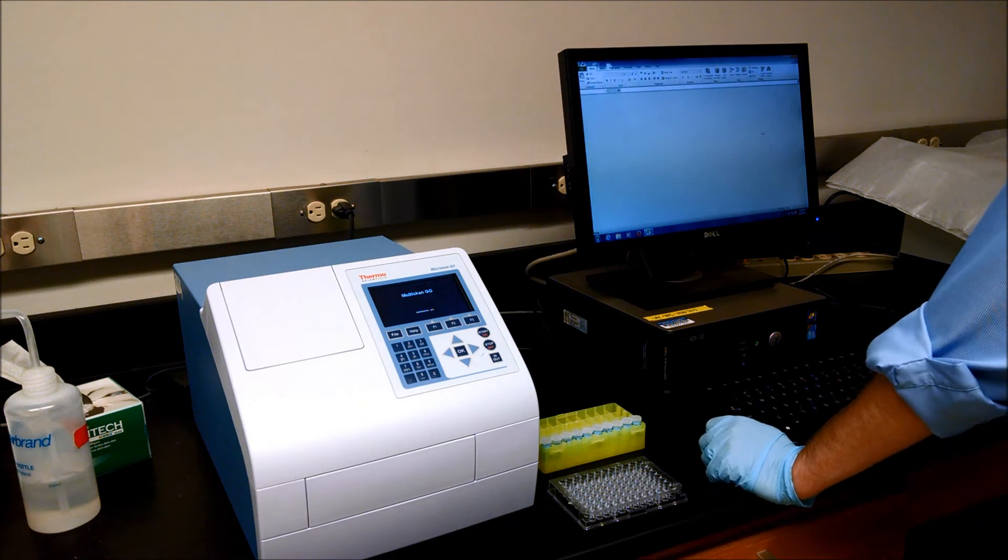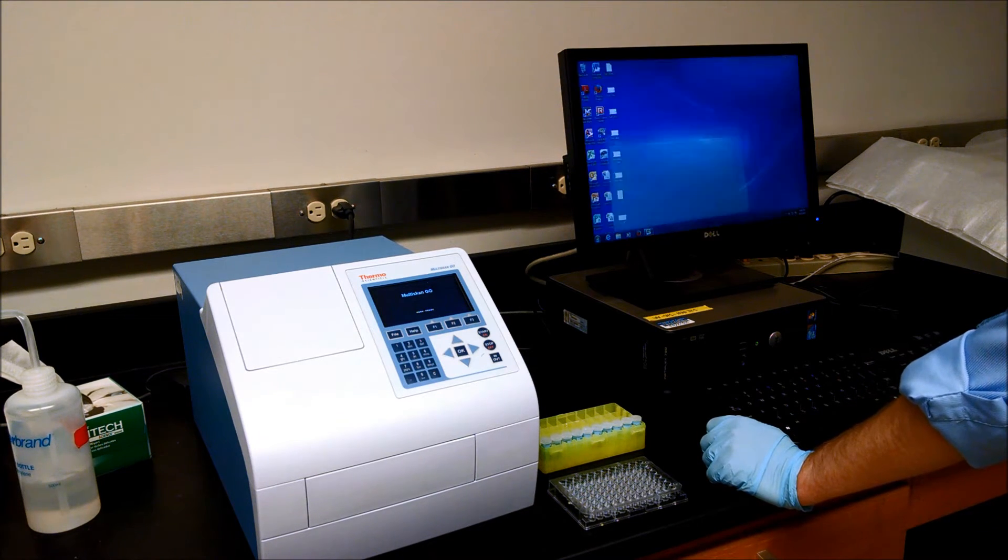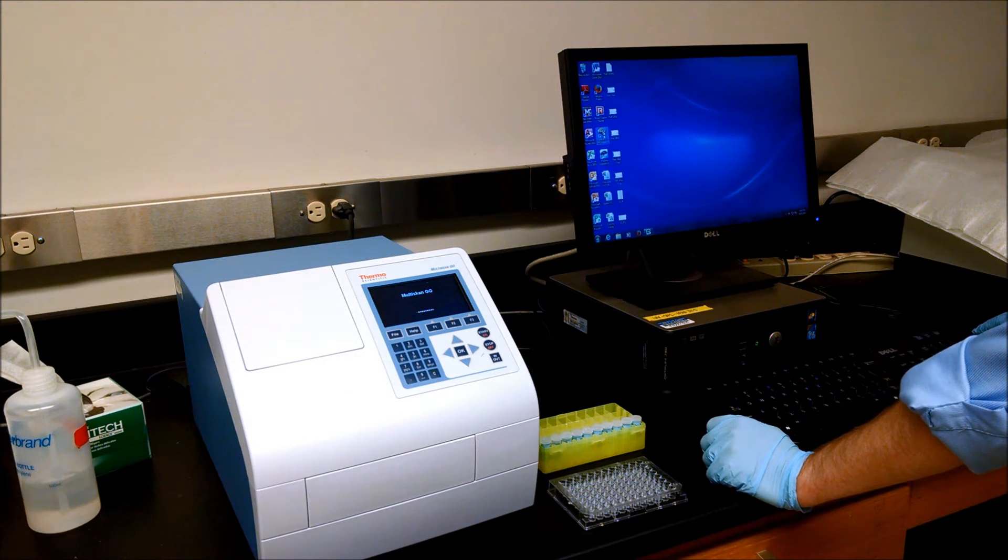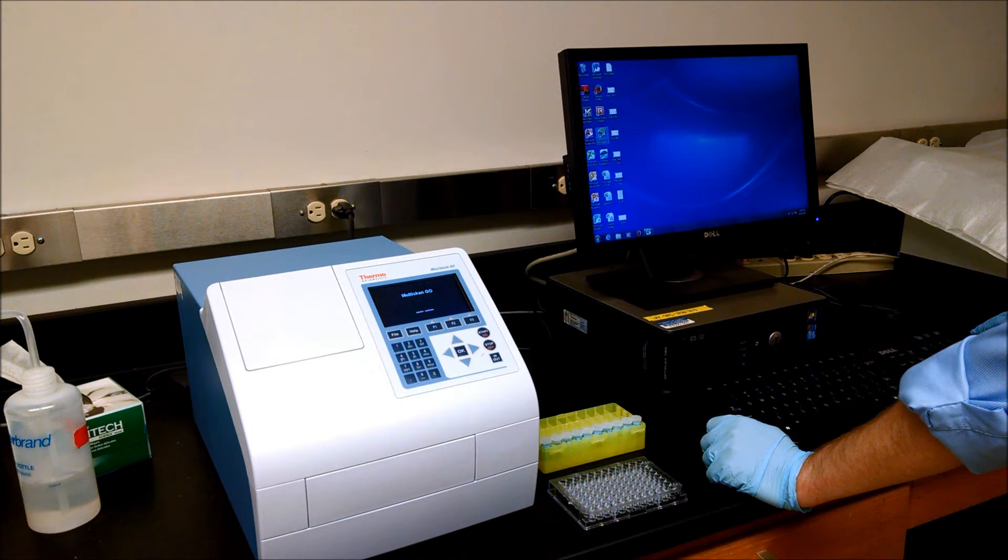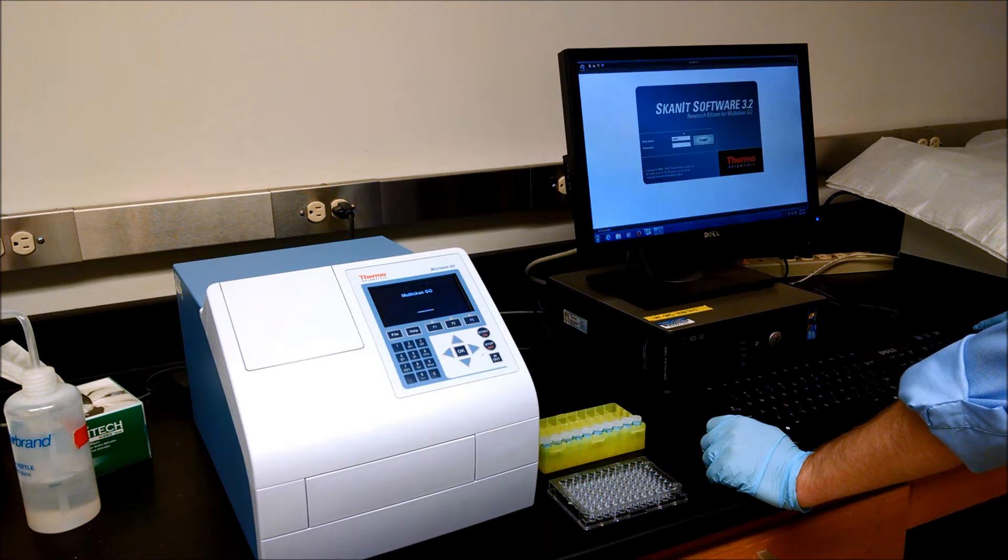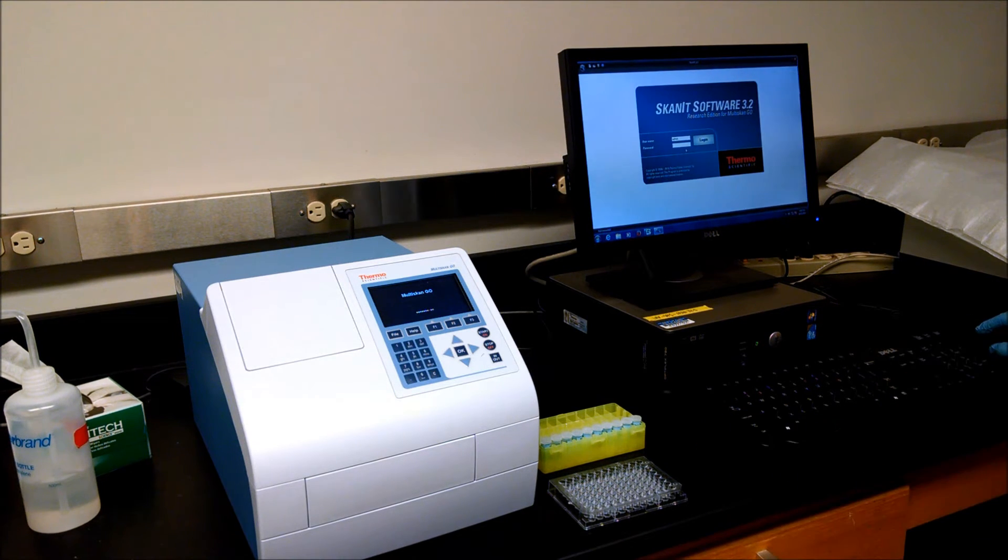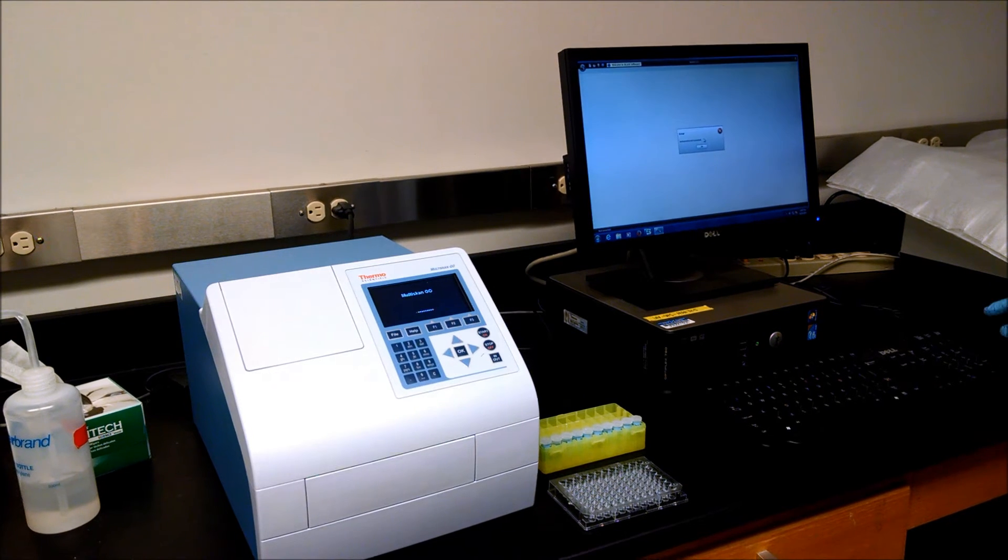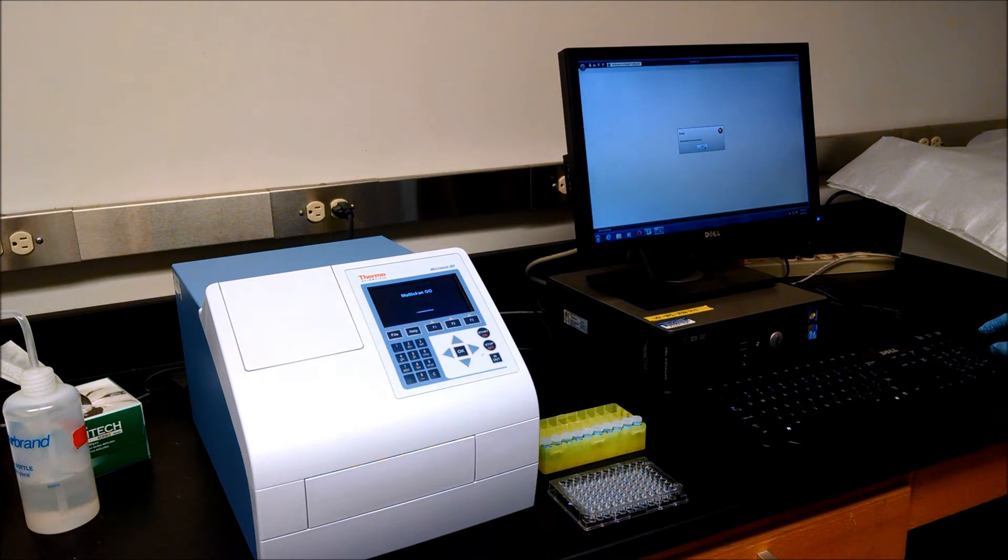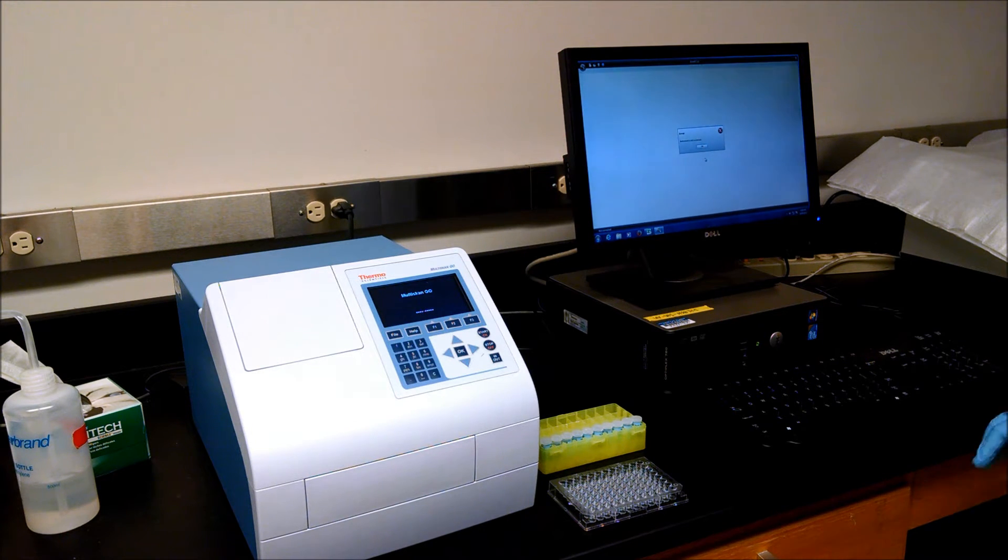While it's doing that, I'll show you here on the computer, we want to use the scanitre for multi-scan. It says login, there's no password, so we'll skip that part. The instrument isn't ready, so we have to wait for the instrument to be prepared.